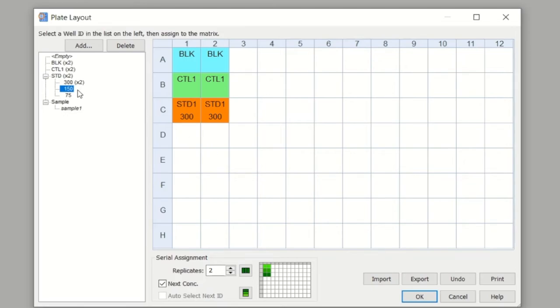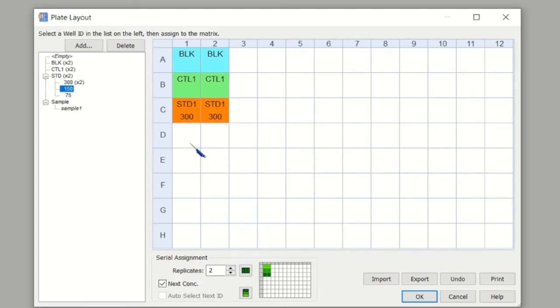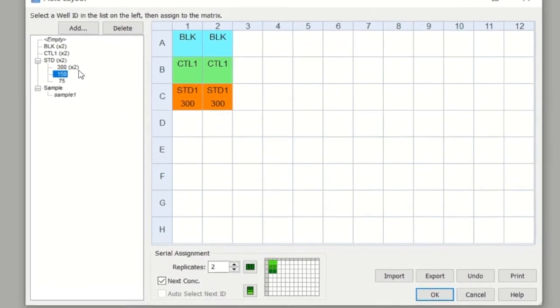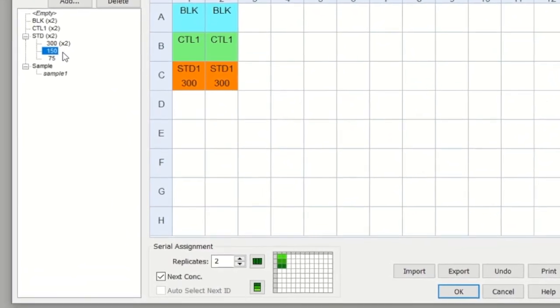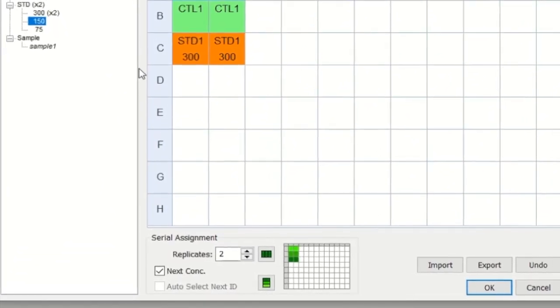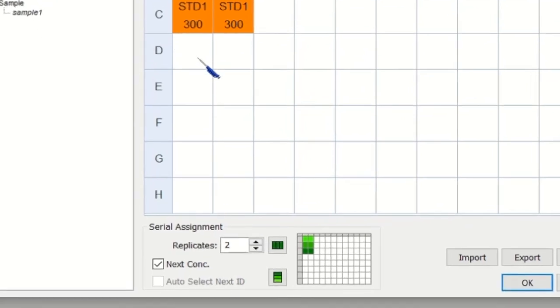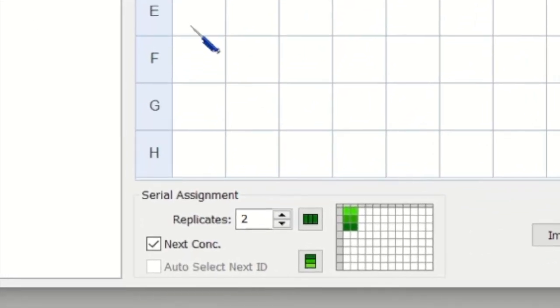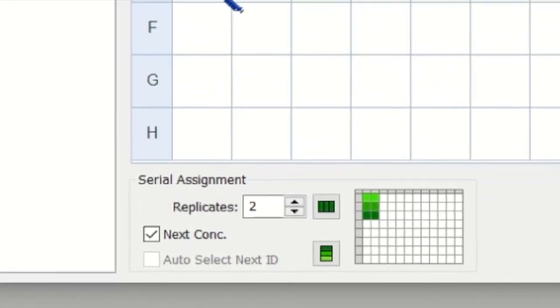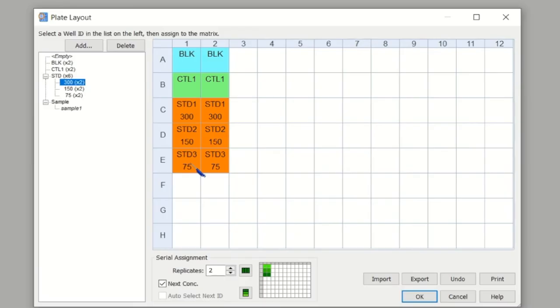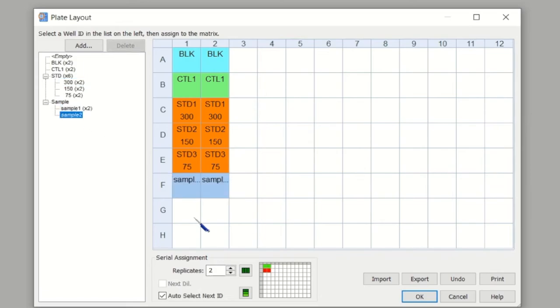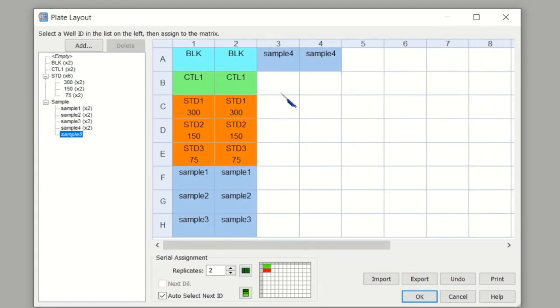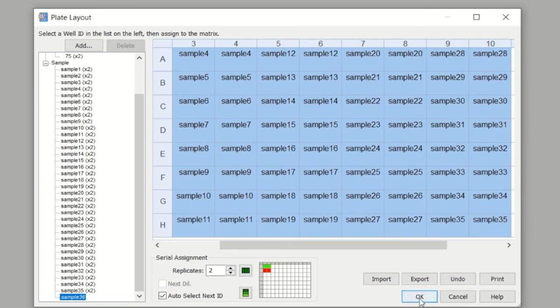Starting off with my standard, I just select the top standard. I see at the bottom that the serial assignment is acknowledging that there are replicates. Go ahead and just click into the wells and it will enter it. By selecting the sample, I can tell it how many samples I've got and which wells they're in. The same for your blanks and your controls.